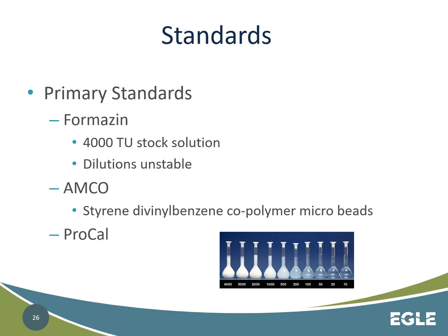So now you're going to be checking, you have primary standards, and primary standards can be a different thing. They come in a different range of stocks, but these are what are used to do a primary calibration on your online analyzers along with your benchtop one. Each different manufacturer is going to have a different set of primary standards that you can get. Some use glass rods, some use the primary standards such as formazine. Some of them have gels that they use. They come in a set. It's very important to make sure that these are not outdated when using them to calibrate your machine.